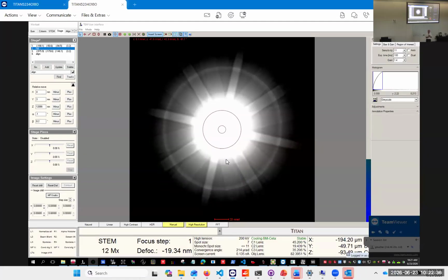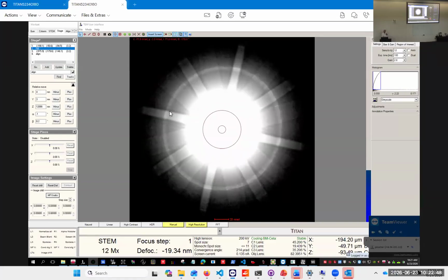Yes. So it's a 30 milliradian aperture, and you can see very nicely the higher order Laue reflections. So actually a ring. So it's here, right? And you see this ring much clearer when you do that with a convergent beam. Very easily, you have very few spots in this higher order Laue zone that are within the excitation error.